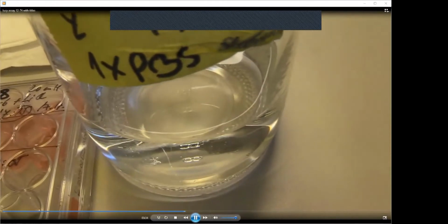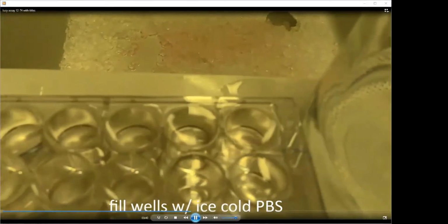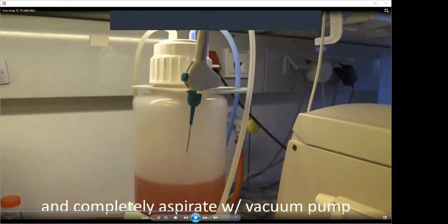So you dump the medium and add PBS into the plates. Then you aspirate. It's necessary to completely aspirate this PBS, because if you leave some PBS there, that would dilute your sample when you do the lysis.